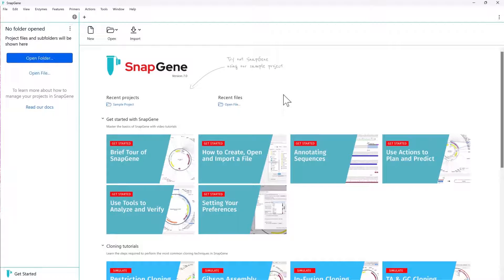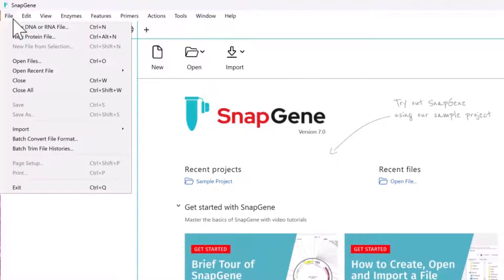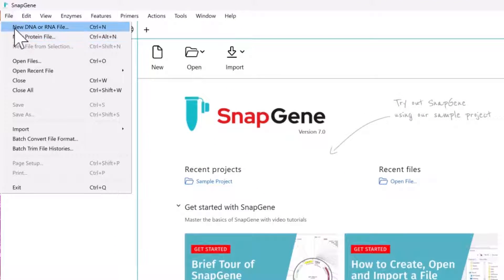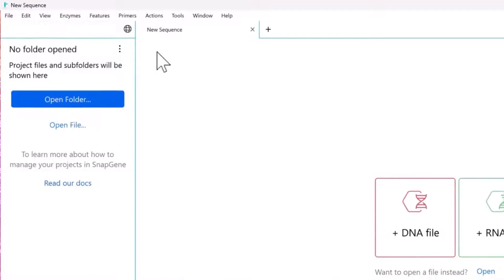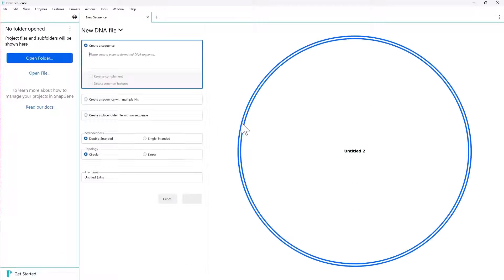You can create a new DNA or RNA file directly from the Getting Started screen, either from the File menu or by selecting New and choosing your desired file type. For example, select to create a new DNA file.